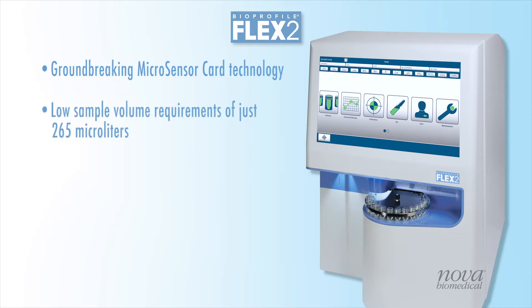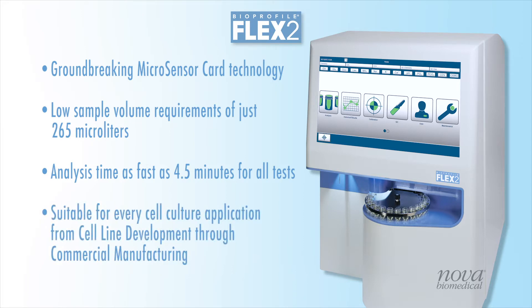Flex2's 265 microliter sample volume and 4.5-minute analysis time for all 16 tests make it perfect for use with low-volume culture systems in cell line development and process development. Its 21 CFR Part 11-compliant software makes Flex2 equally suitable for commercial manufacturing.